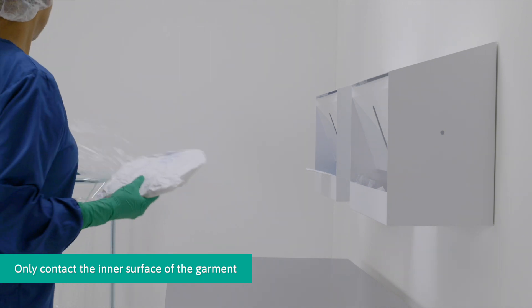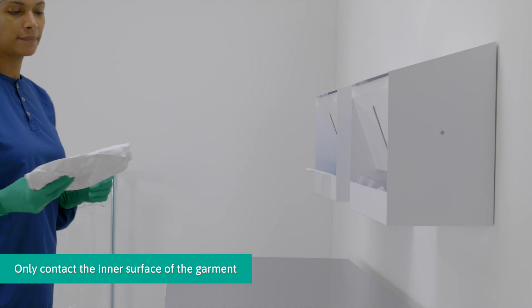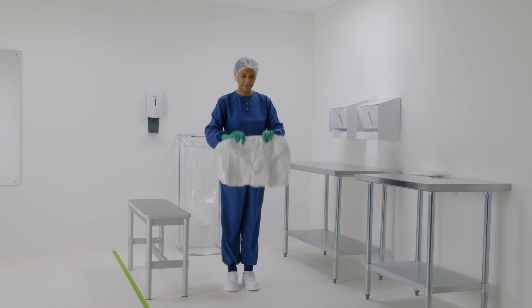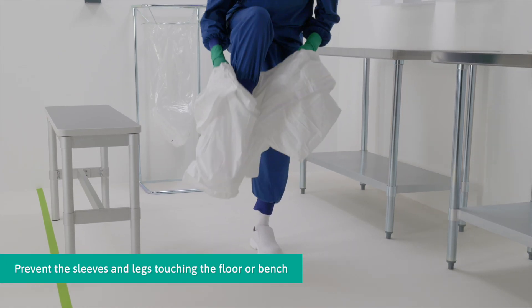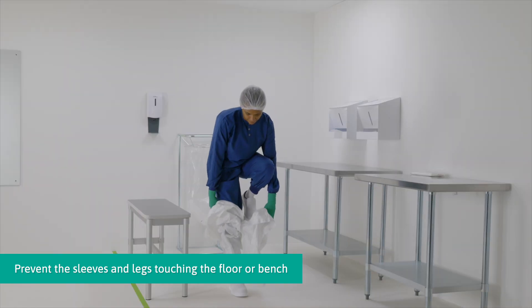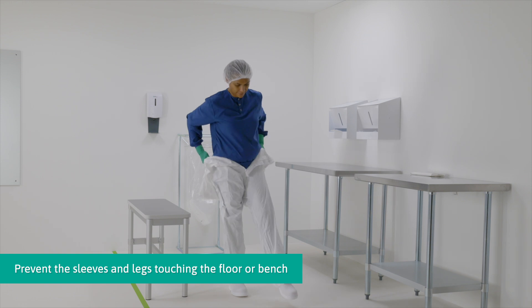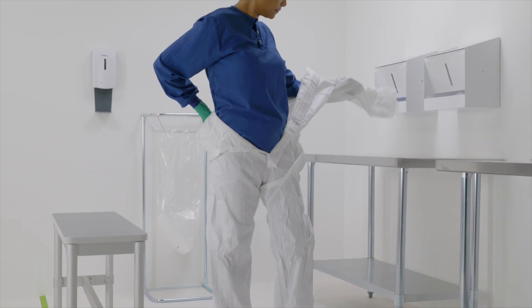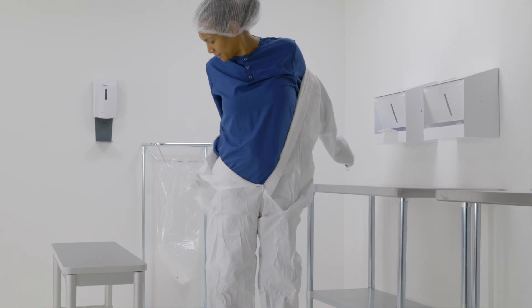Grab the coverall at the waist area. Carefully insert one leg into the coverall, then repeat with the other leg. Bring the coverall up towards the shoulders, then insert the arms into the sleeves.